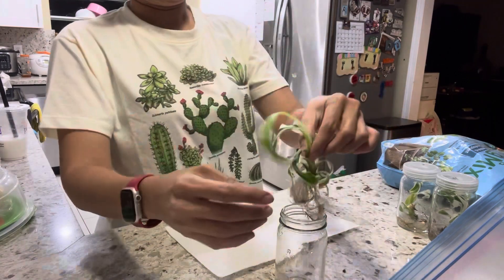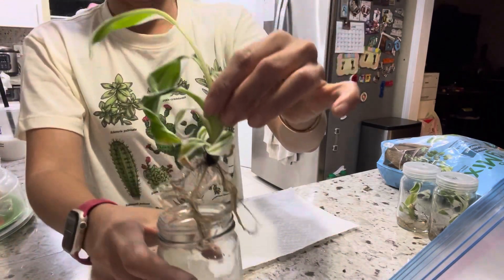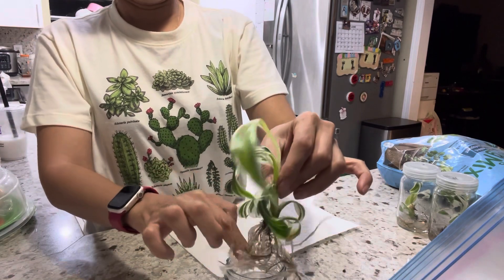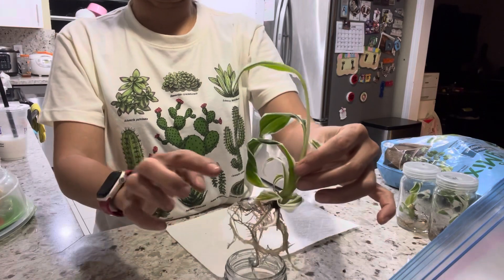You can see a lot of gel with good roots. Now you're going to wash the gel off the roots under the water. Make sure the water is a little cold, not too warm.